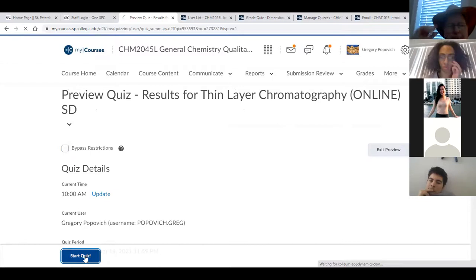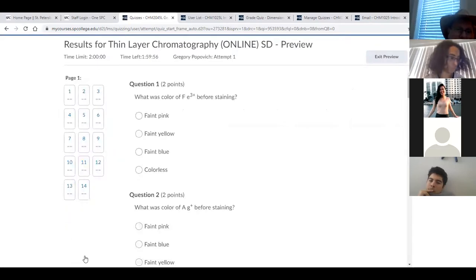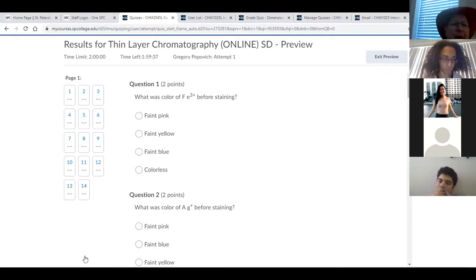And start quiz. Okay. Now, Dr. Musgrave, I honestly think he is color challenged, because some of the things that he sees on this staining are different from what anybody else sees. Use that chart in the data table to match the colors up directly.